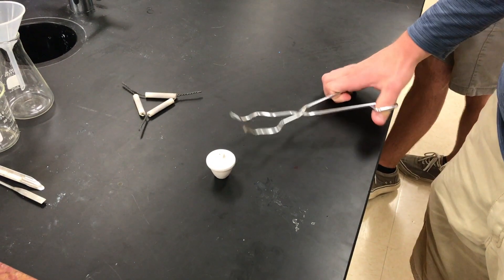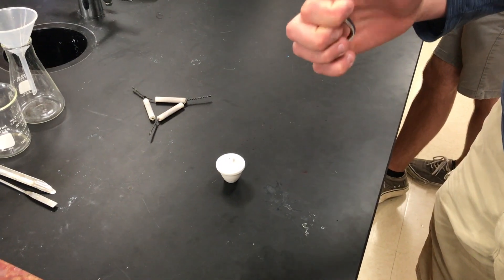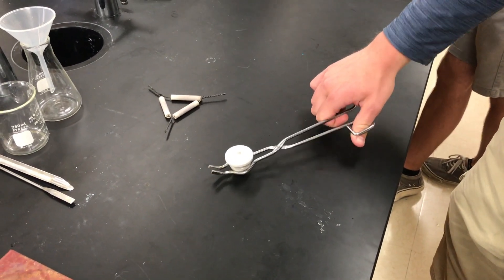This is a crucible. When you pick it up you want to use these tongs because otherwise you'll burn yourself as a crucible is usually hot.